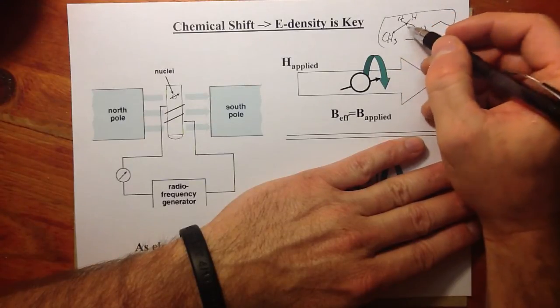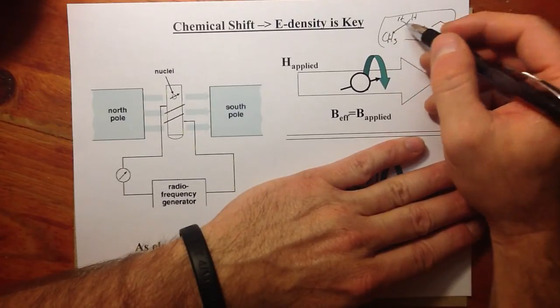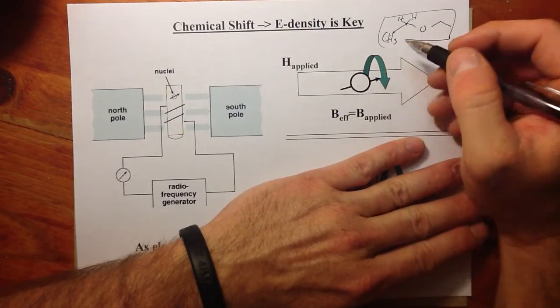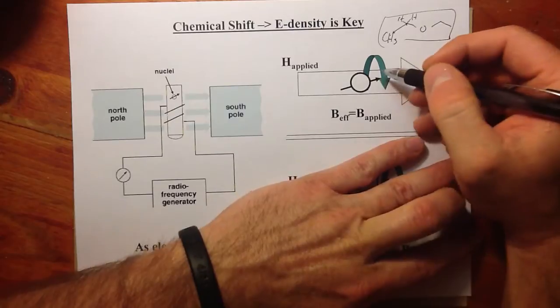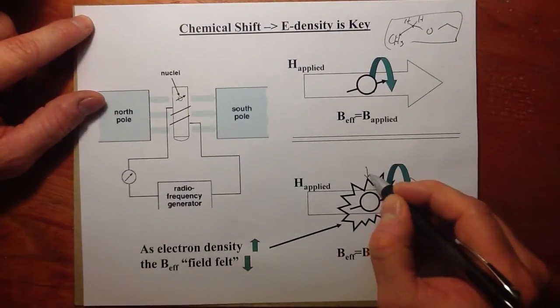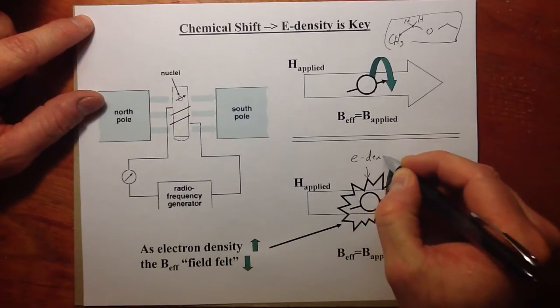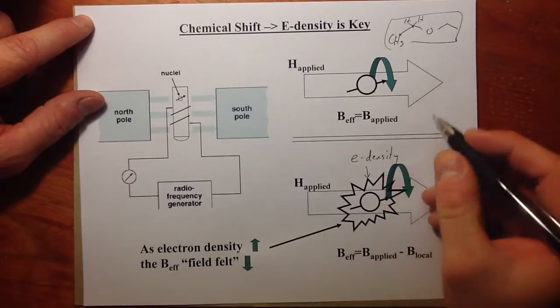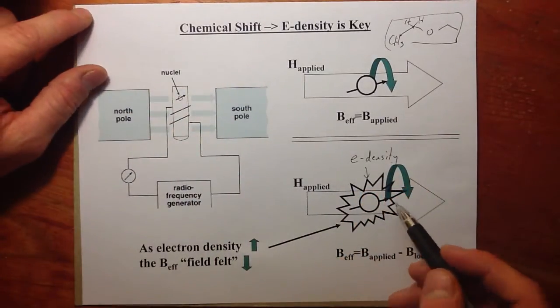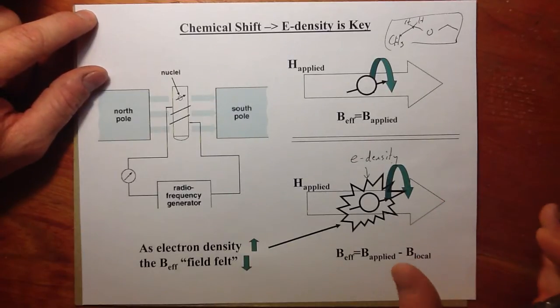for these two hydrogens is not exactly the same electron environment for these three hydrogens, because there's electron shielding around the nuclei, the little field. We can have differences in their precession frequency around that big field. So because this is supposed to be my electron density, this sort of BAM signal, my electron density around each proton is slightly differing. I can have a different precession frequency, and therefore a different radio frequency will excite it.